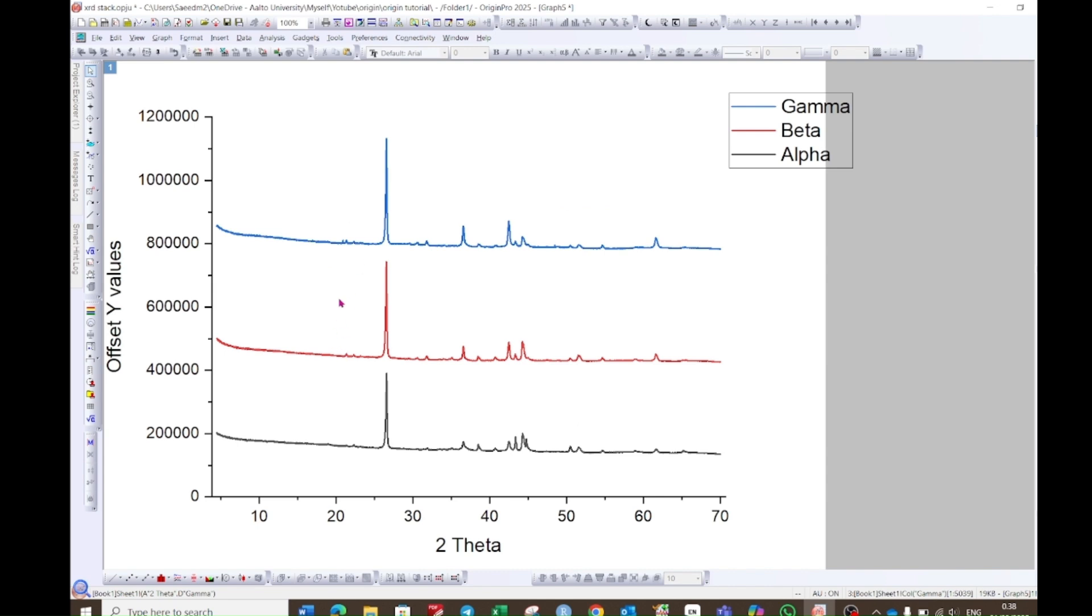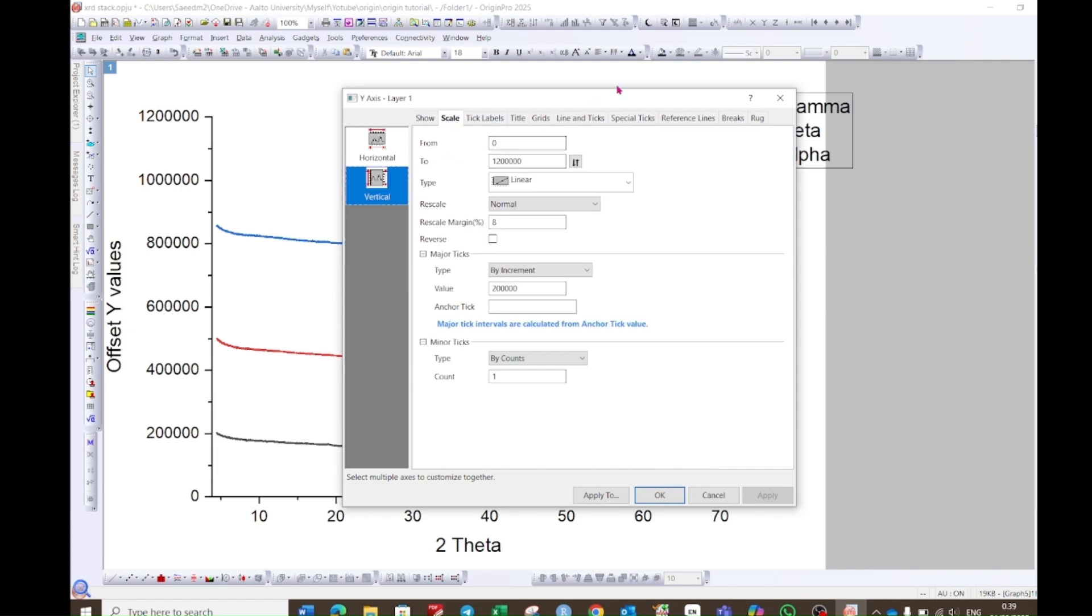For example, if you want to have more distance between these graphs, then you can double-click on this y-axis. It will pop up. Go to the scale option.